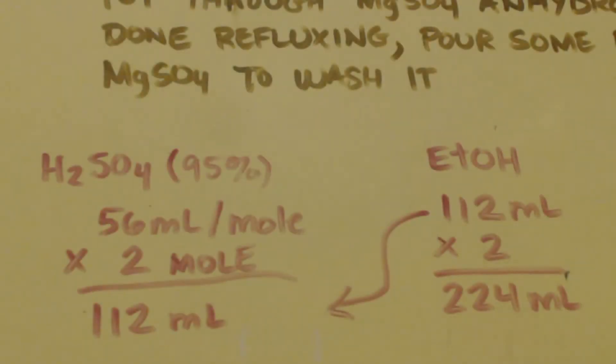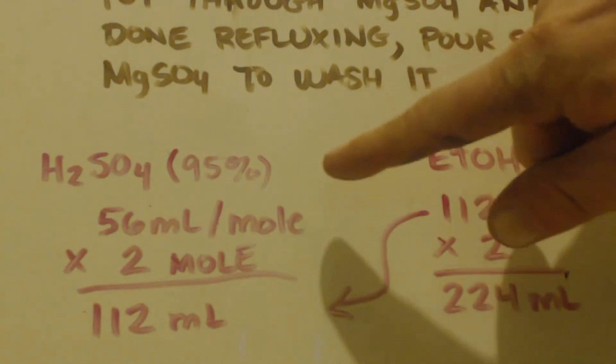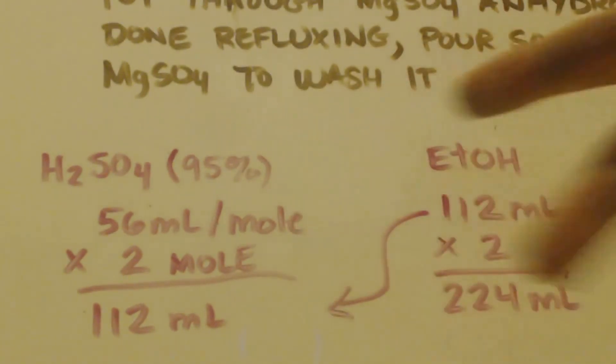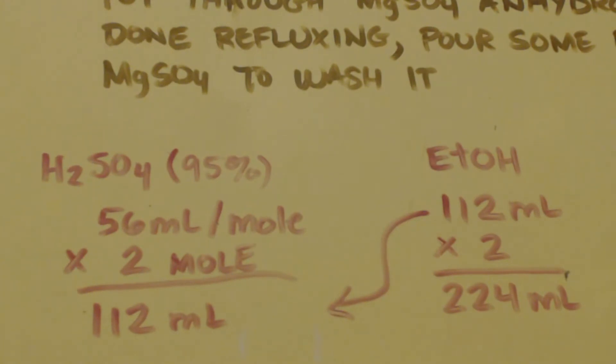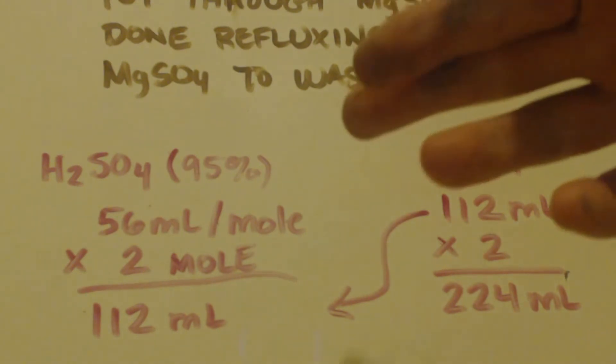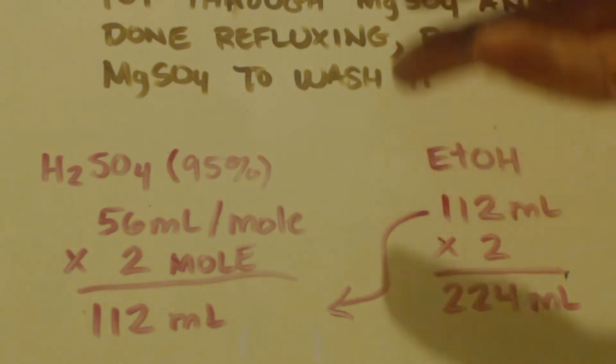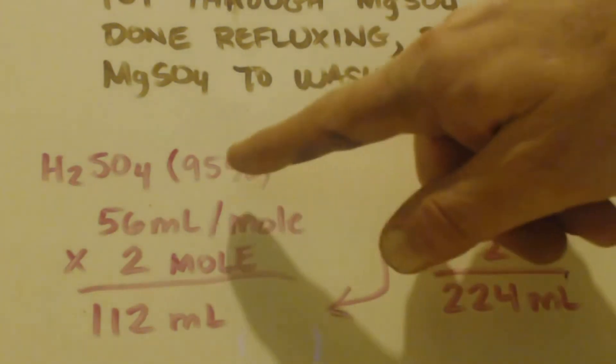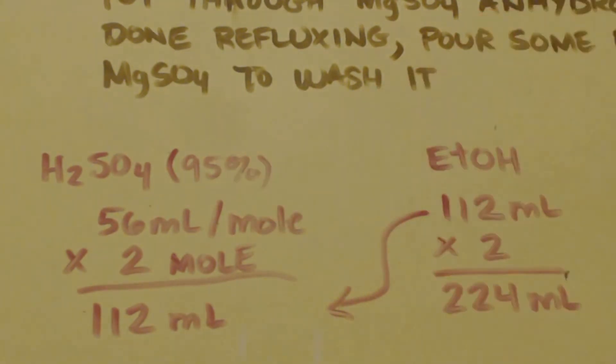Now, remember, it was a two-to-one ratio. You wanted twice as much ethanol as you have sulfuric acid in volume. So what am I doing? I have sulfuric acid. I'm guessing because I'm not doing anything special to it. I'm just using it right out of the bottle. We're going to guess and say it's 95%. So I think it was 54 milliliters was a mole or something like that. But if you divide it by 0.95 or whatever, you get 56 milliliters out of the bottle to get one mole of sulfuric acid.